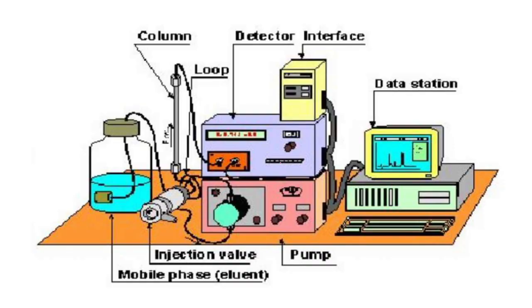Now this you can tell as the entire structure of the chromatography system, where this is the column, and this is your mobile phase with which you would be eluting. Here you inject your sample, and it flows through the column. With this injection valve, the mobile phase pushes your protein forward and helps the macromolecule or compound flow through this loop, after which it is detected in the UV, because of which you get peaks in the data station.